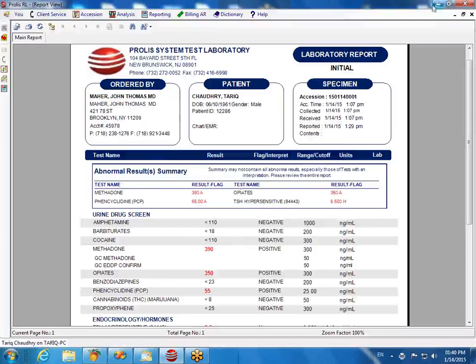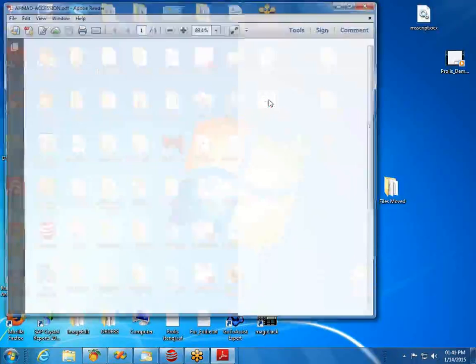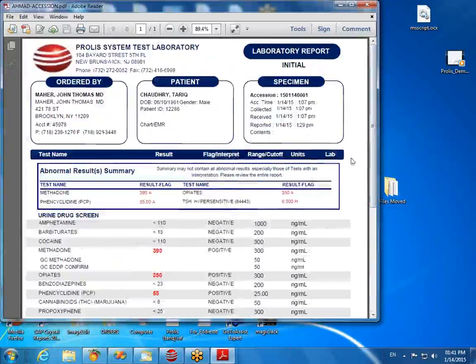I am going to, it is here somewhere. I don't know. I see it. It's right there on your right. Oh, on my right? Keep going up. One more. Oh, and then right. Okay. If you open it, this is the report in PDF form. I see. Okay. I'm going to send it to you.